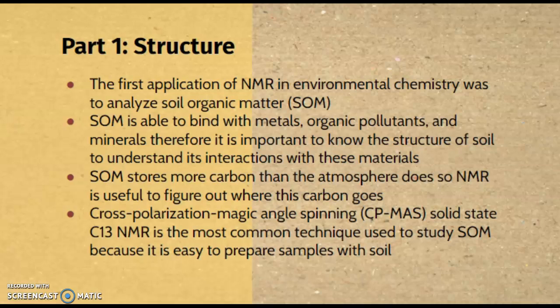And the NMR is useful to figure out where carbon goes when it leaves the atmosphere. And cross-polarization, magic angle spinning, solid-state carbon-13 NMR is the most common technique used to study SOM because it's easy to prepare samples with soil, as opposed to using solution-state NMR.